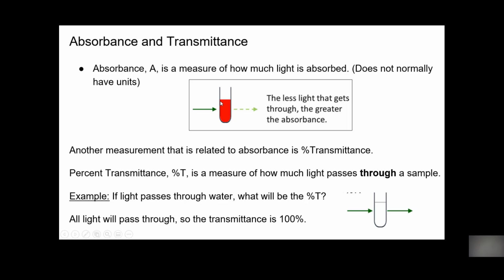So in simple words, the more the light is getting stuck in here, the less is traveling through it. If the solution is not as intense or concentrated, then more is going to pass through it.